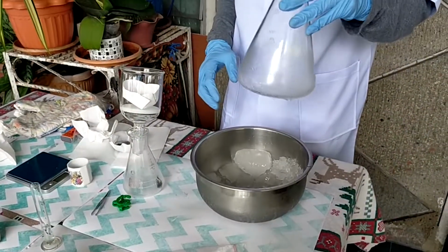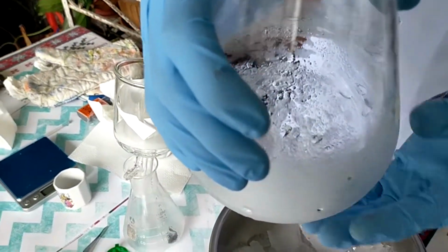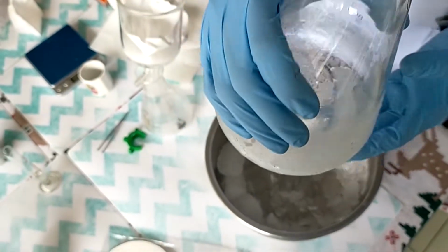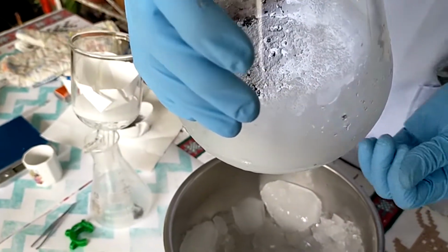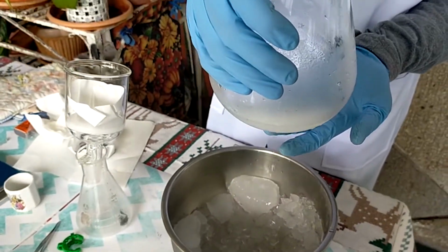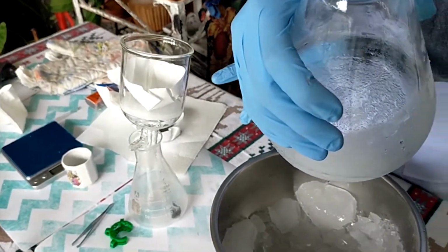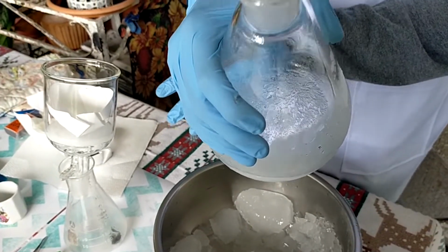Okay, now you can see that after some time and subjecting the mixture to some ice cold water in an ice bath, it has become cloudy, and you see here our naphthalene. Now what we will do is we will filter this so that the collected naphthalene will remain, and then we will weigh the remaining naphthalene to see how much we obtained.